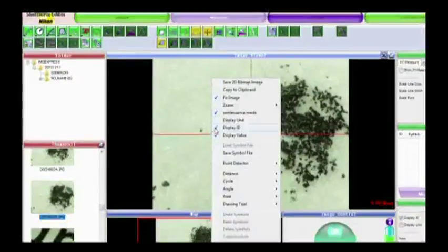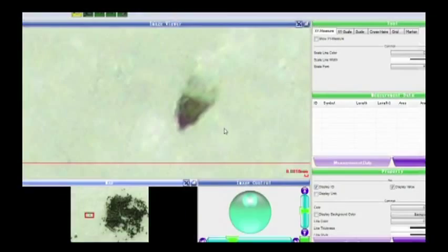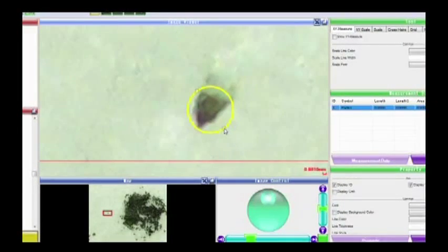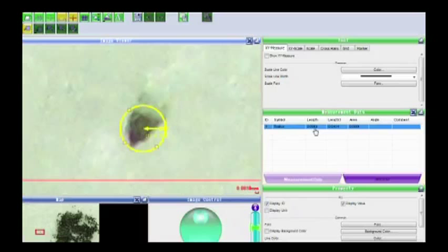What we're looking at right now is a period at the end of a sentence from a laser-printed document. I want to measure how big individual laser toner particles are. I'll zoom in to 500% and pick out a single toner particle, then use the radius measurement tool to draw a circle around it. The result shows a radius of 6.8 microns, meaning the particle is roughly 14 microns in diameter.